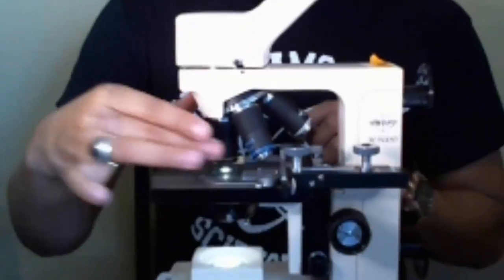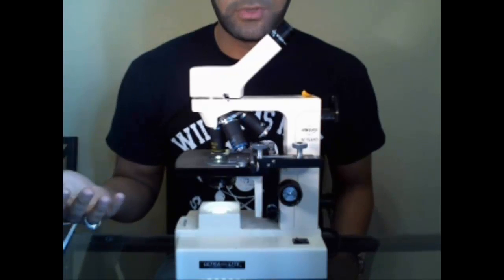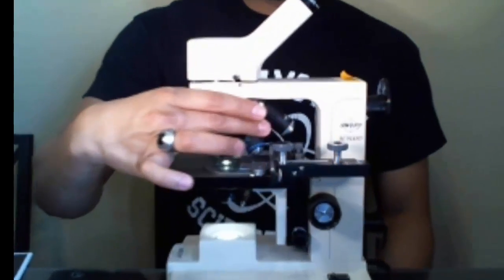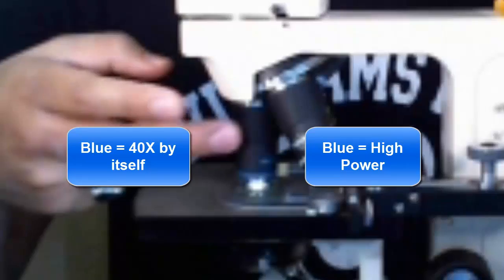The red objective, which some microscopes have, has a 4x magnification by itself. Combined with the 10x eyepiece, that gives you 40x total — you multiply, not add. The yellow objective is what we consider the low power objective, and it has a 10x magnification by itself. Combined with the 10x eyepiece, that's 100 times larger than actual size. So when using the low power objective, whatever you're looking at is 100 times larger than it really is.